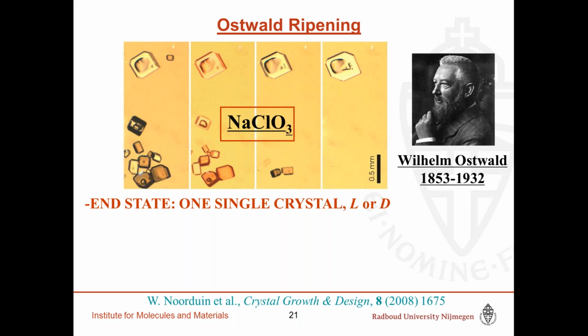I'm sorry. Yes, the last question from Laura Hernandez. Thank you for the very nice presentation. Any idea how to try to crystallize a pure enantiomer that is amorphous? We have crystallized the racemic compound, but it is very difficult to achieve the crystalline pure enantiomer.